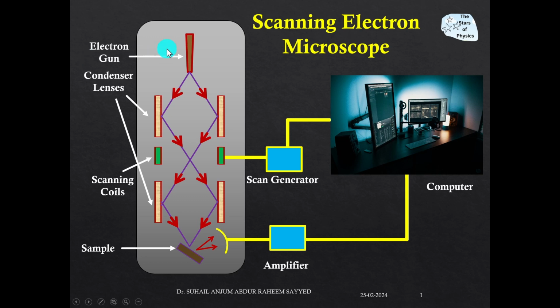Hello and welcome. In this video, we shall see the scanning electron microscope. We shall see all the details, that is principle, then the instrumentation and the working and different images, as well as what are different applications of scanning electron microscope.